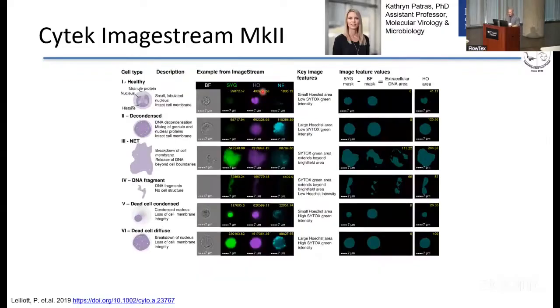So after a few pilot experiments on the ImageStream, Dr. Patras, being curious and taking the initiative upon herself, started digging in the literature to see if anyone else had looked at NETosis by IFC. She stumbled across this paper by Leliot, where they had actually already used the ImageStream to characterize NETosis into 6 phenotypes that you can see here. After we discovered this, we thought, okay, let's try to reproduce this analysis in the context of urinary tract infection.